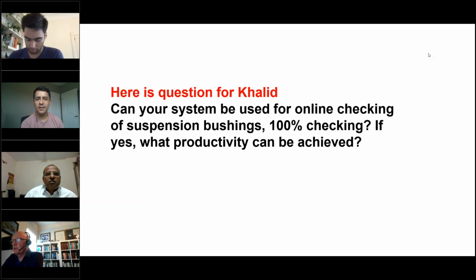Something like an oscillation test. Perhaps an oscillation test, yeah. High frequency oscillation, I'm thinking. Is that vibration analysis? I think the best thing I could say here is if whoever wrote this wants to email me with specifics for their tests, we can explore it for sure. We do have some people that do online checks or inline manufacturing checking with our system along the way to catch things earlier. So there's a bit of flexibility in there.